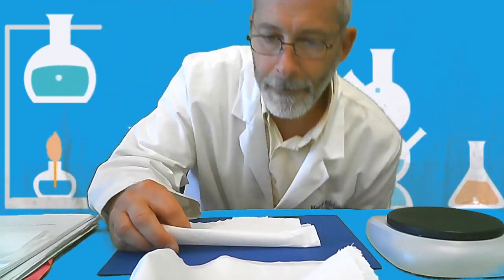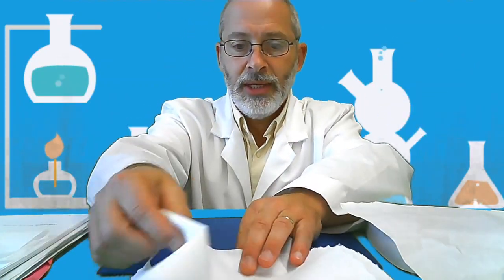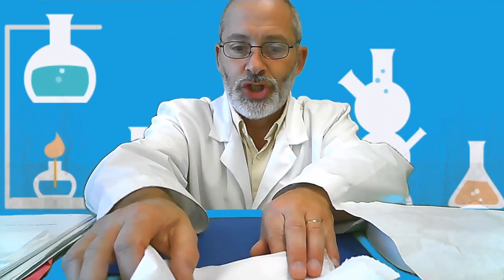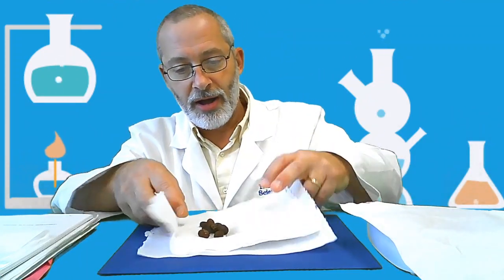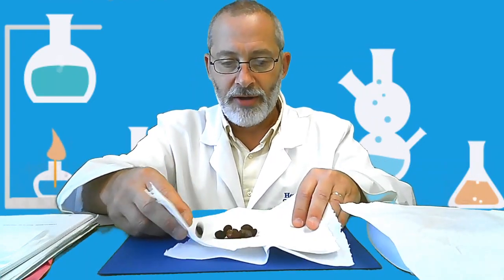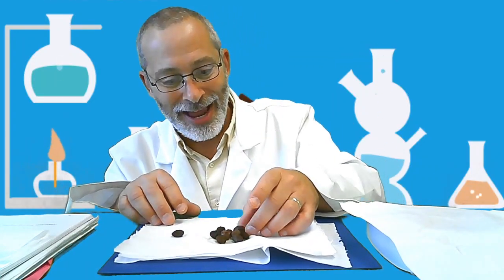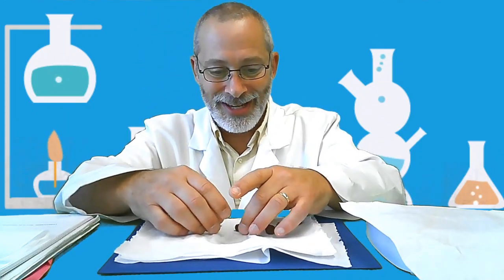So here we go. I'm going to keep this one dry for the digital balance. We've got our raisins. I'm very gently dabbing the water off, jiggling them around to get all of the excess water off. And check out these raisins, man. Very cool. I'll line them up for you to see.